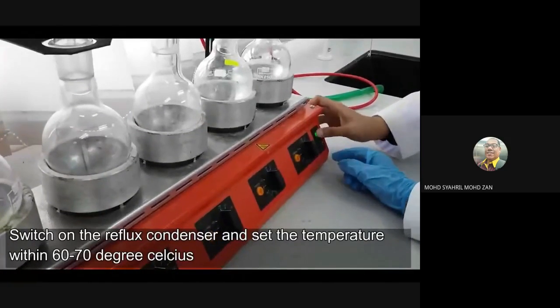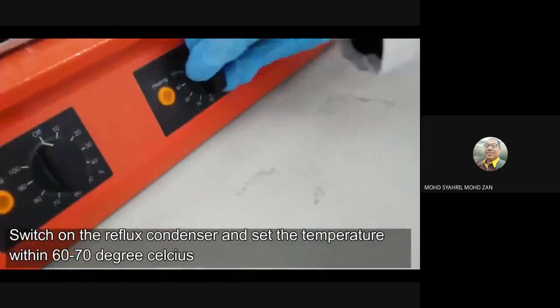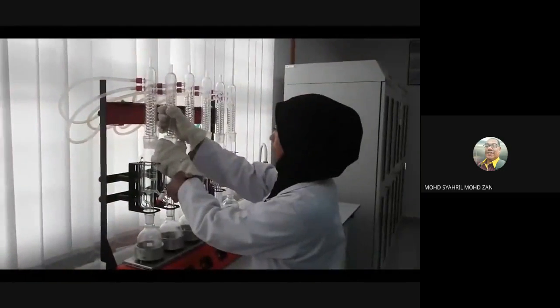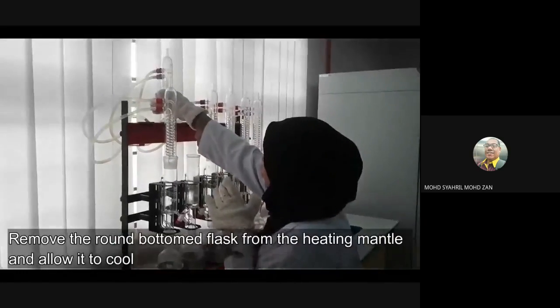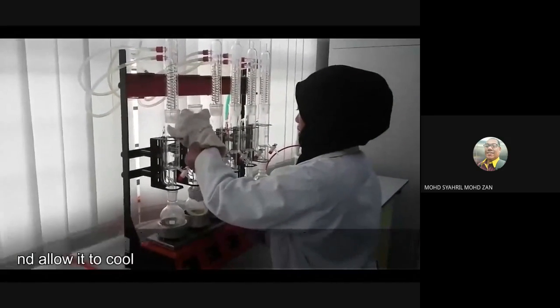Switch on the reflux condenser and set the temperature within 60 to 70 degrees Celsius. Remove the round bottom flask from the heating mantle and allow it to cool.